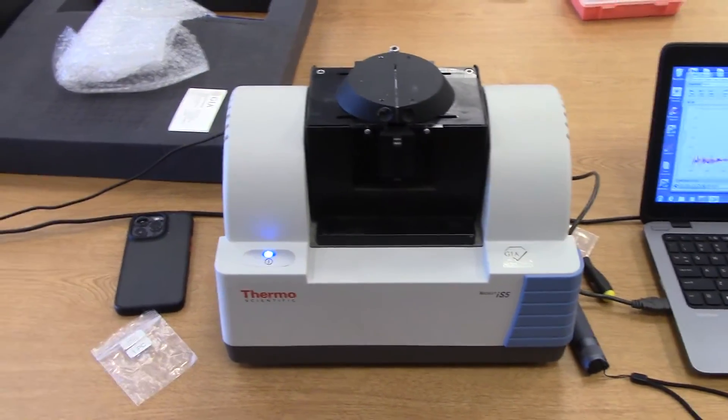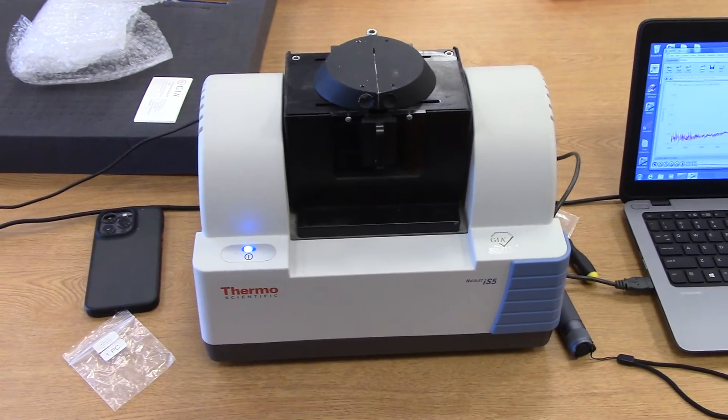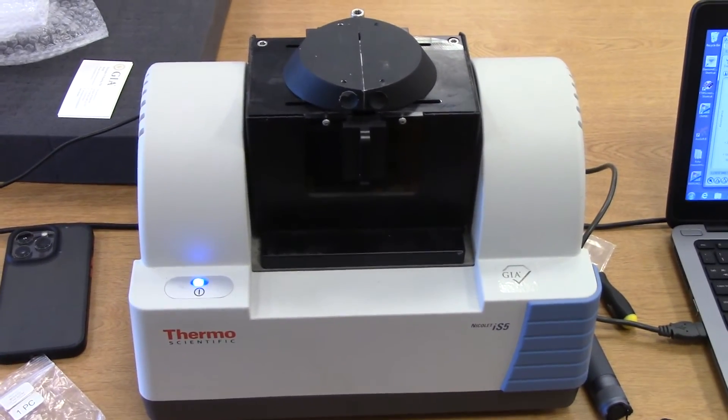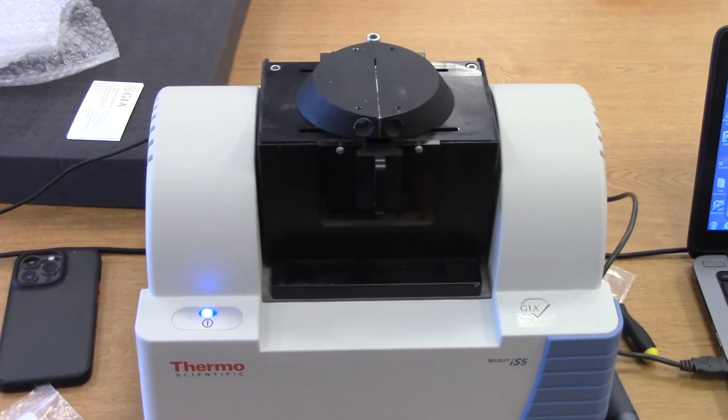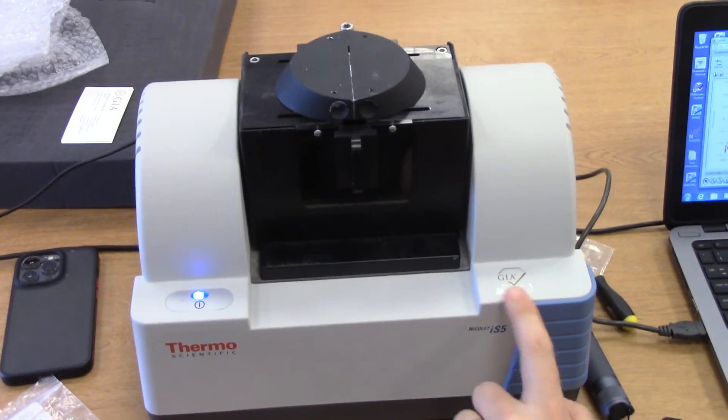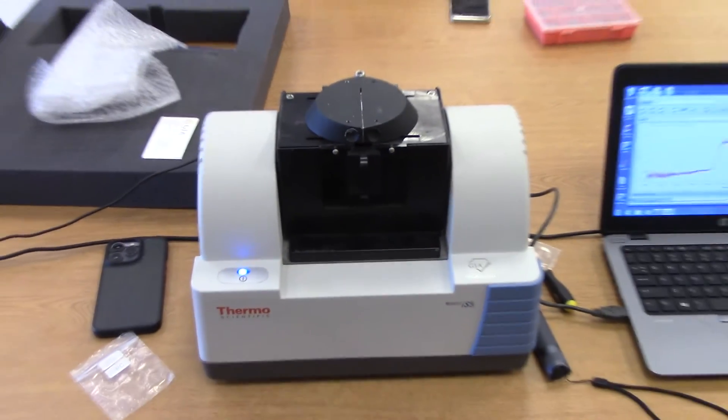Sure, but it'd be useful, right? Oh yeah, priceless! My colleague over here came up with the idea and I love it. That's fantastic. Tell me again the name of this? It's a GIA Diamond Check. Excellent.